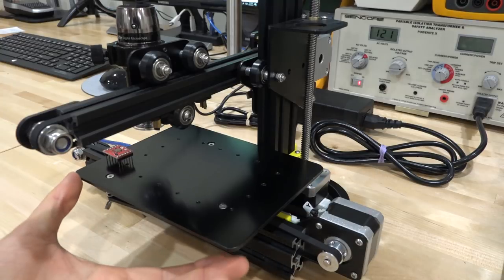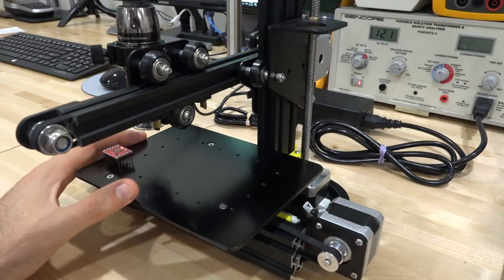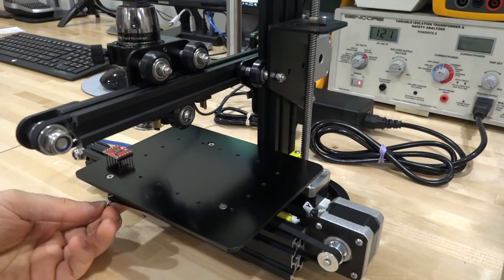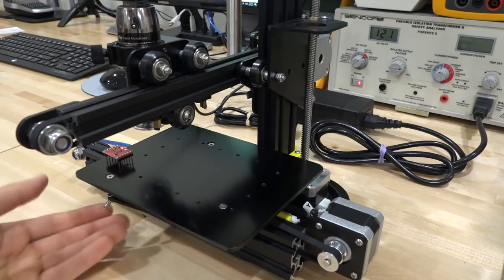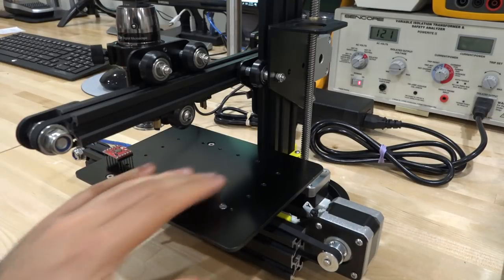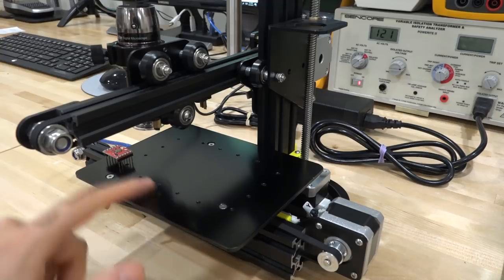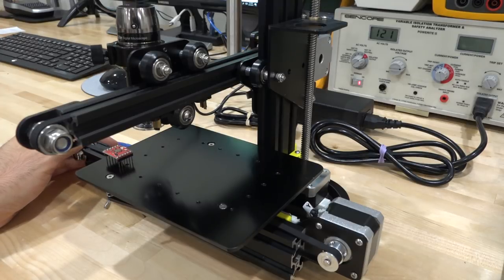Another nice feature is that the platform is actually controlled by springs. Springs have a few advantages: first, if you crash the microscope into it, it gives a little bit of give so it doesn't cause too much damage. But the main advantage I like is it allows very fine focus adjustments when you need to make a tiny adjustment, which is very handy at such high magnification. One thing it doesn't have that I wish it did is a platform to allow rotation so you can rotate the object you're looking at. Even if it was manual I'd be happy with that. So now we can go ahead and turn it on and see how it behaves — so far I haven't had any major issue with it.